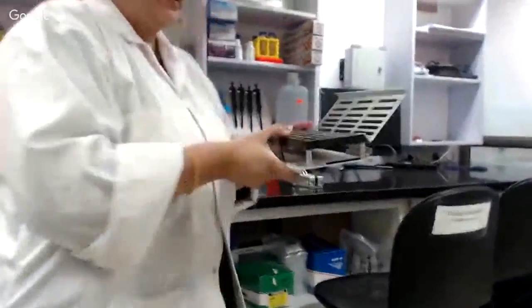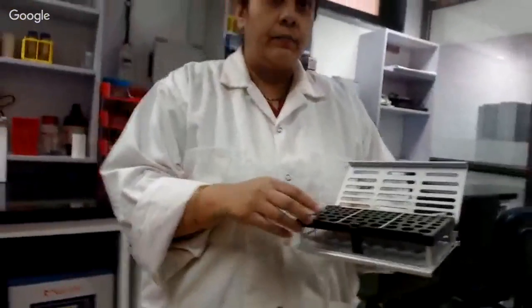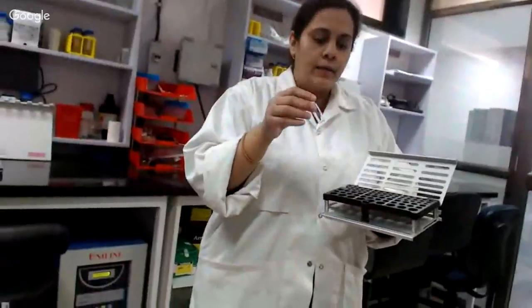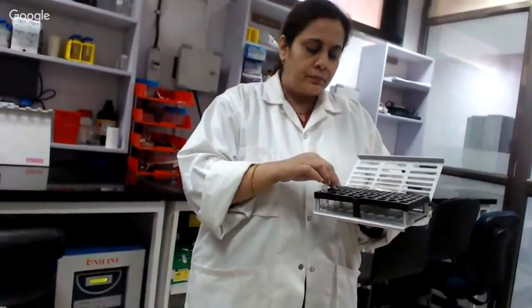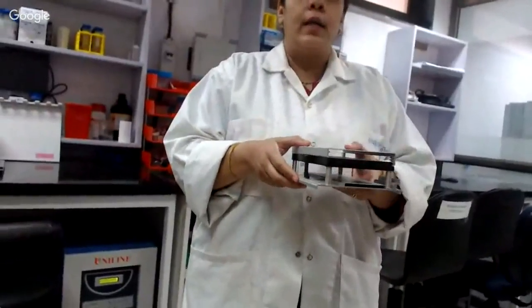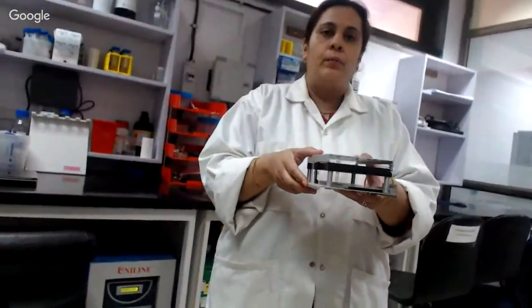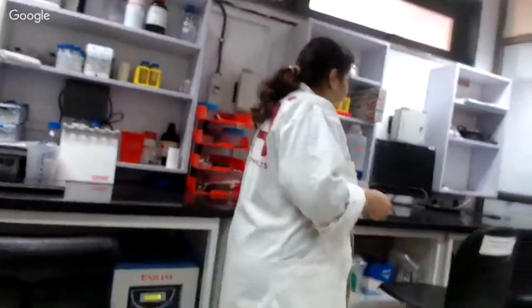And then we typically, this is a sample reagent rack. These are some of the vials where we can place our ligands, our analytes, our buffers, and then you close the rack and put it in the sample compartment rack. We won't actually be able to show you how this is done because we have an experiment running, but you must have seen this in your interactomics course, how the experiment is carried out. So now let's go straight to the data analysis part.